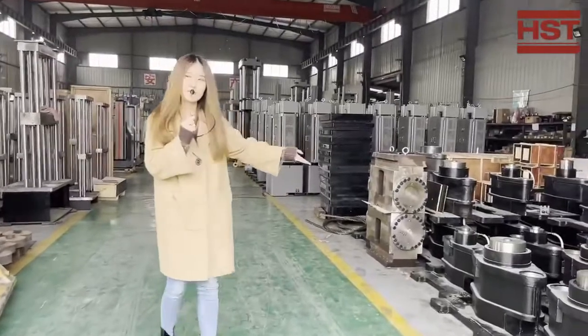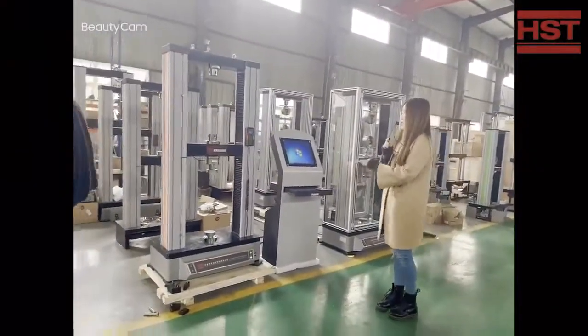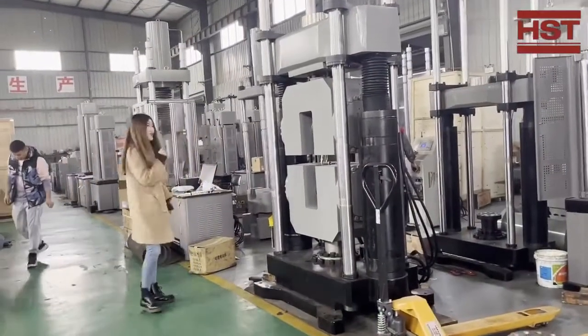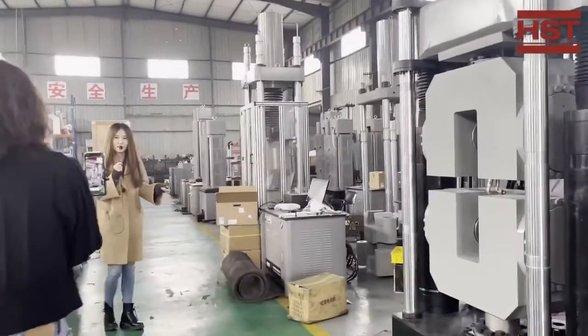This is all the accessories for the equipment, and this model is computer control service. Later on we will introduce each piece of equipment. You can see all our technical team is working on the project right now.